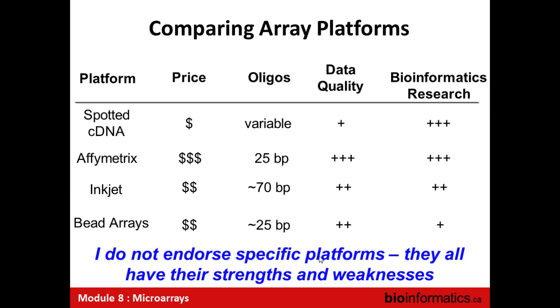I say clearly, I don't endorse any particular technology. They all have their strengths and weaknesses, and we use all of them for different types of experiments. And you shouldn't just say, I'm going to use Affy because I like the sales rep. It's important to think through why you use a different technique and whether it's appropriate for the experiment that you're looking for. Yeah, Chris.